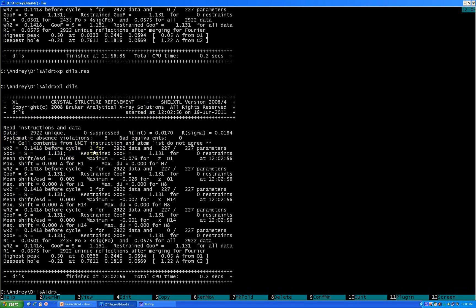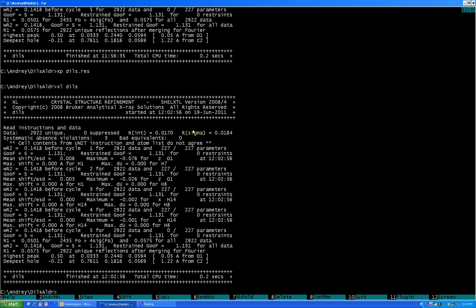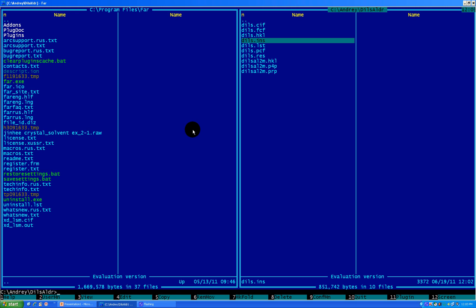Cell contents from unit instruction and atom list do not agree. What does it mean? Well, how I told you, in the beginning we gave an approximate formula of the material. Because we never don't know what happens during the chemical reaction and what is the contents of the crystal.